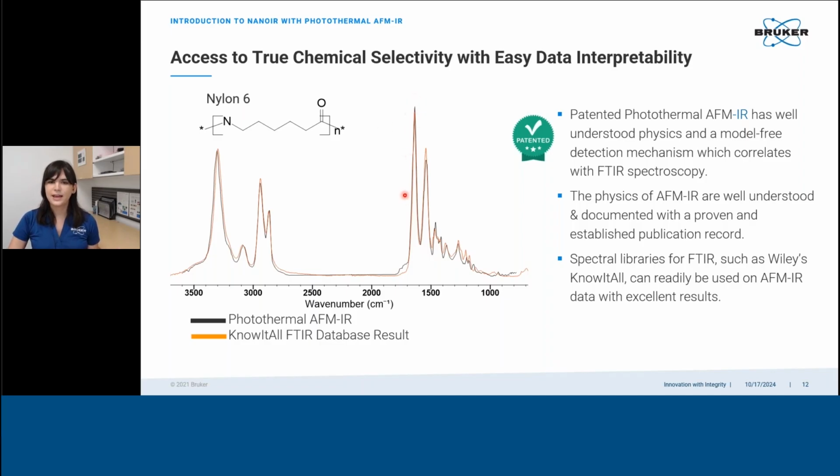So we see the amide 1 and amide 2 vibrations. We see the NH vibration up here, as well as CH stretching vibrations over here. But when we look at these smaller, lower energy vibrations, these are descriptive, and we call this the fingerprint region in an infrared spectrum. And it corresponds to a lot of the ensemble vibrations that exist in the whole system.